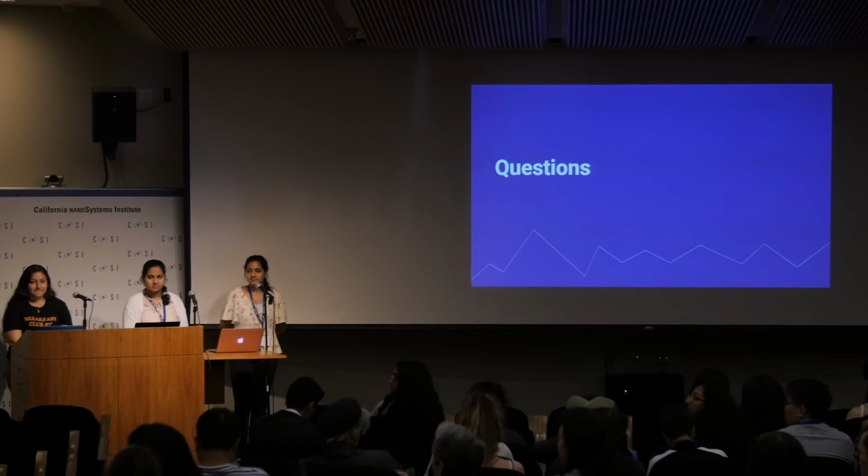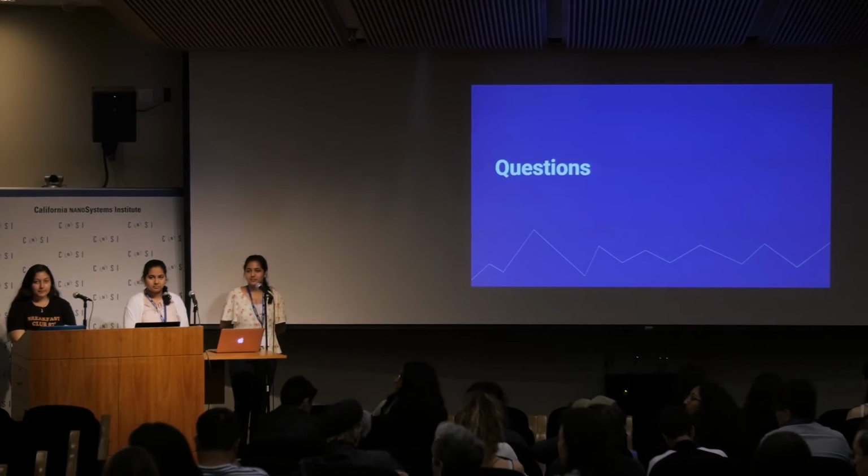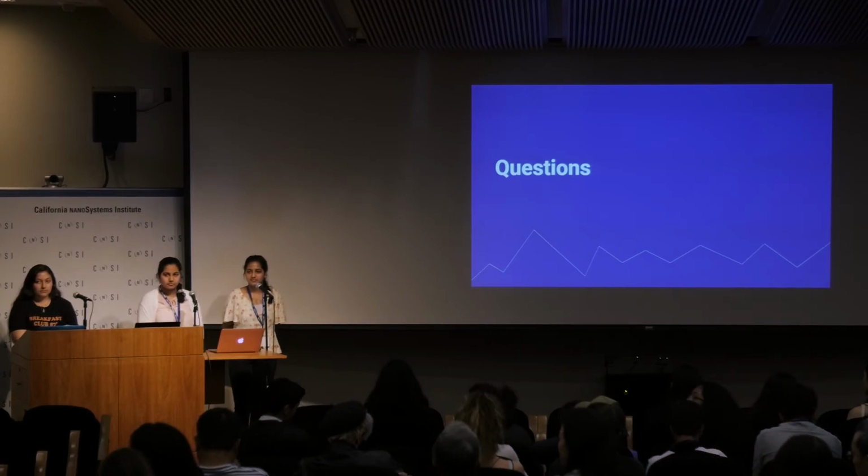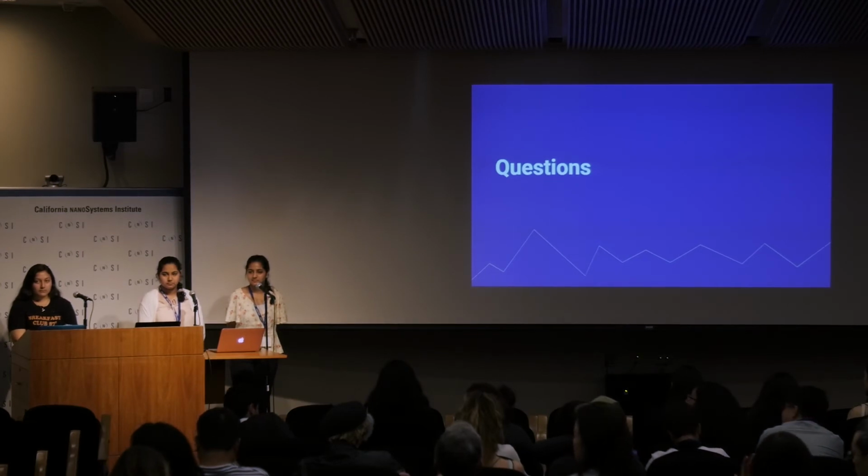Okay, so you're talking about trying to combine the utility of the AFM and the electron microscope, right? So the way you proposed it, there's a bit of a problem. First, what do you think is a potential problem with trying to heat up a sample that's frozen in an electron microscope? Well, we ran into that problem.